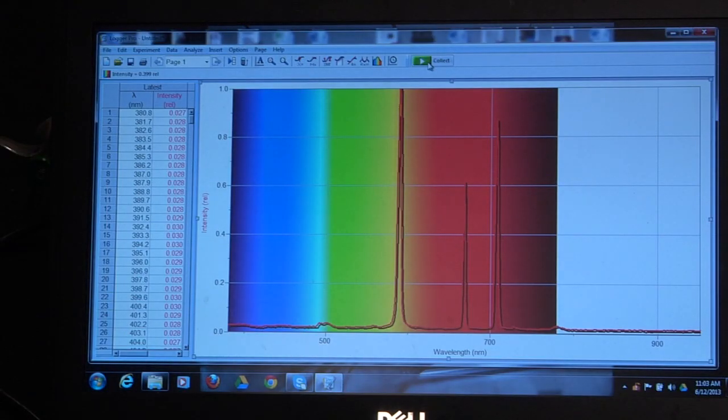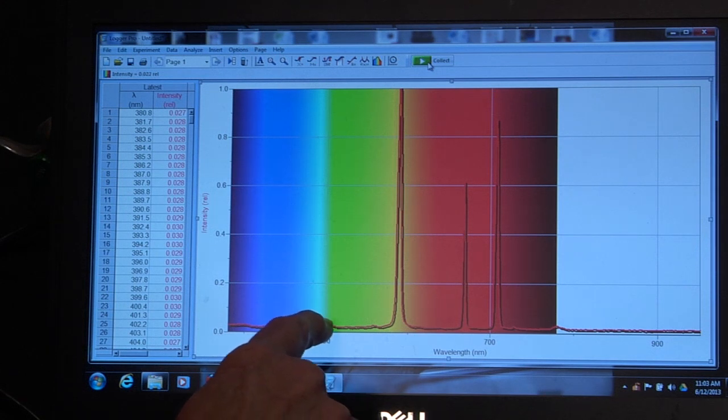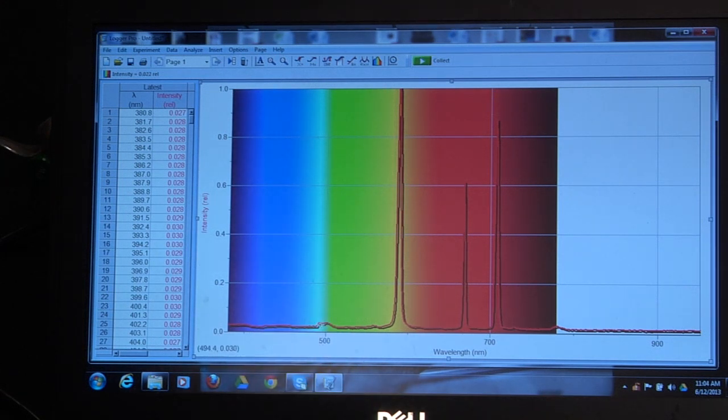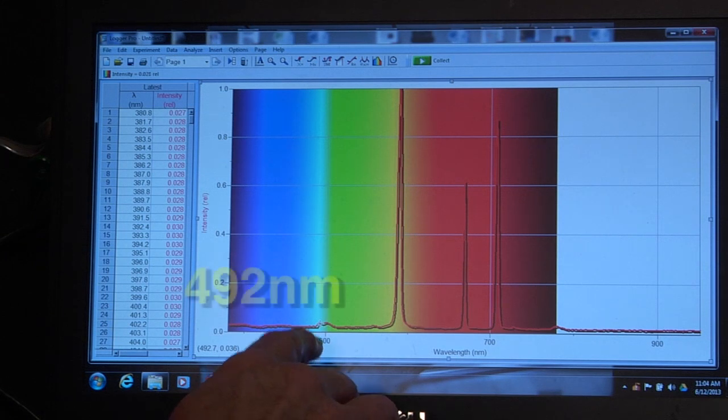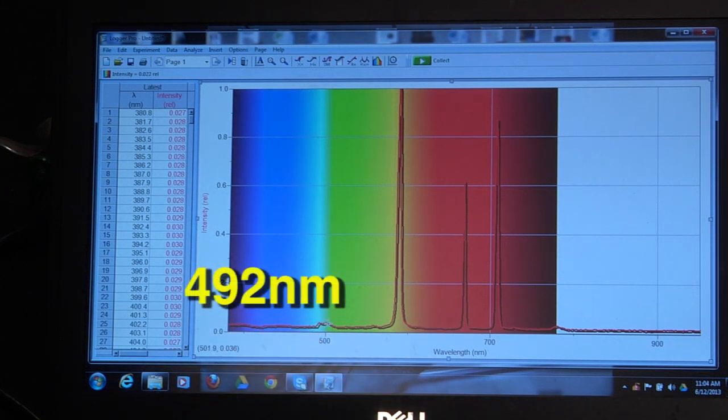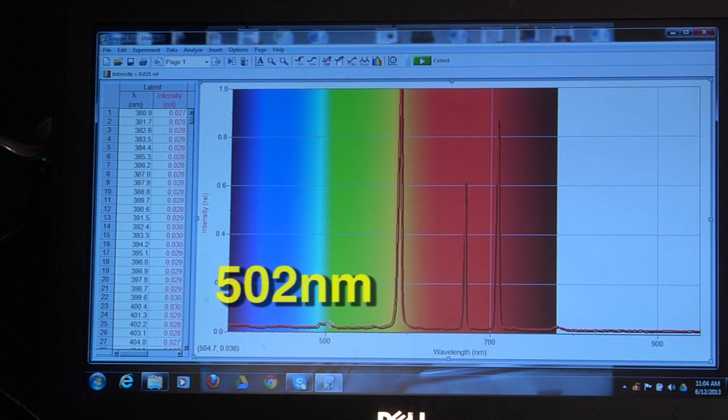What you see here, there are two very faint lines, one at about 492, another one about 502.